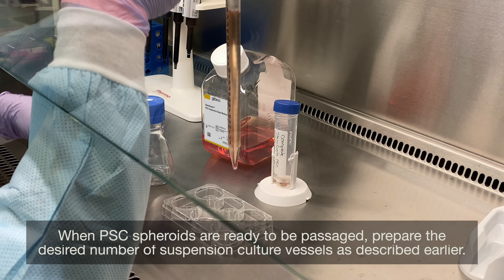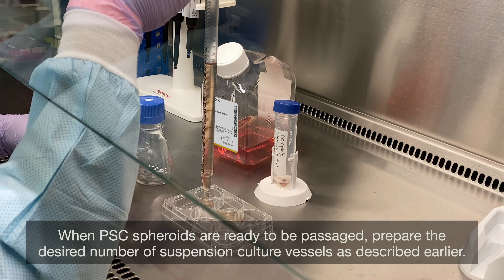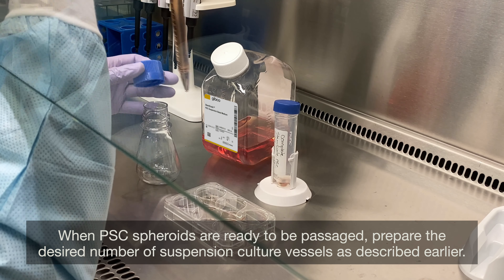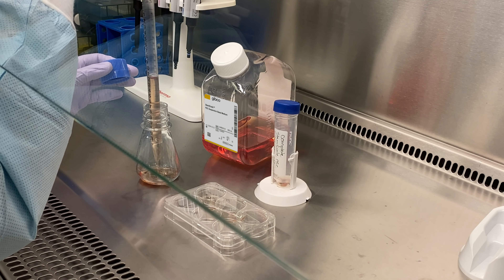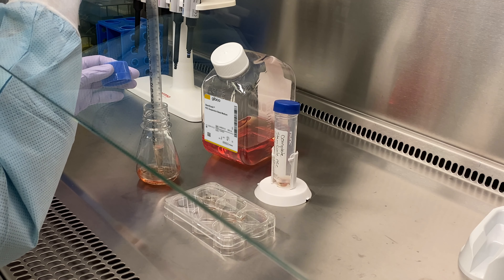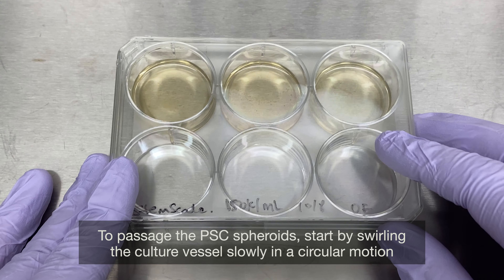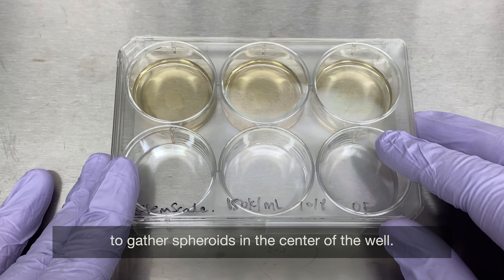When PSC spheroids are ready to be passaged, prepare the desired number of suspension culture vessels as described earlier. To passage the PSC spheroids, start by swirling the culture vessels slowly in a circular motion to gather spheroids to the center of the well.